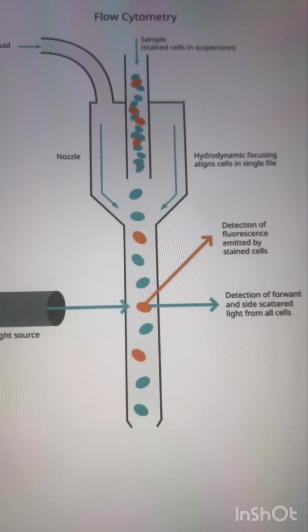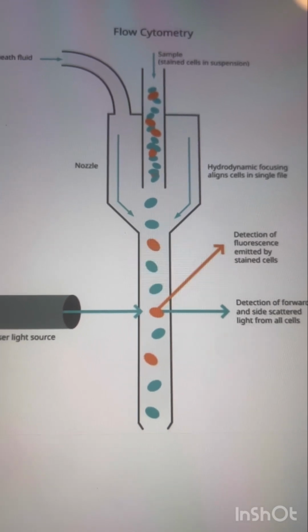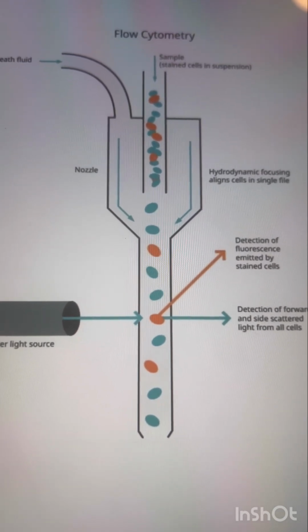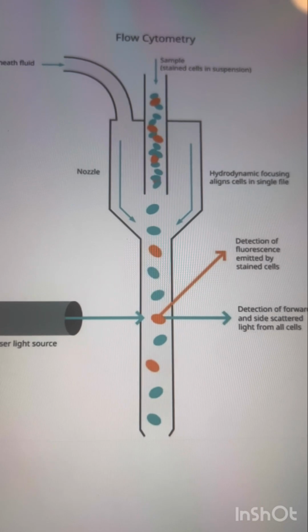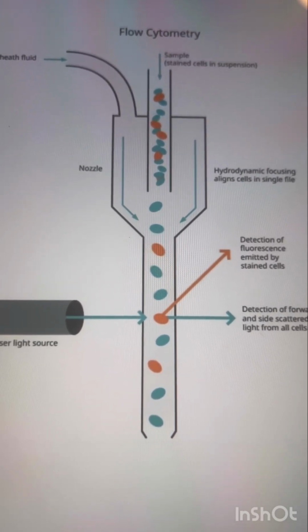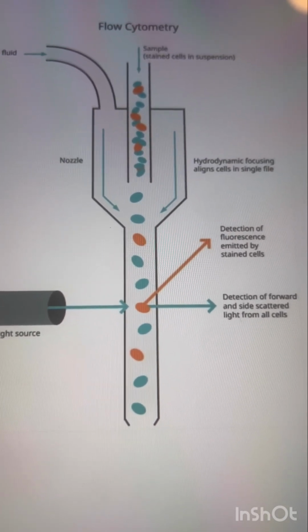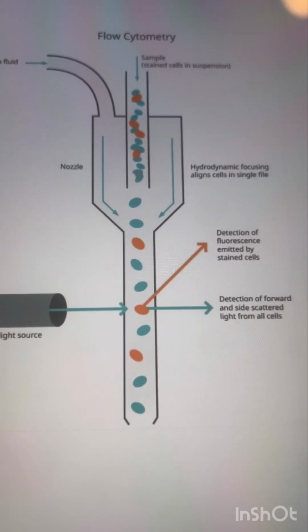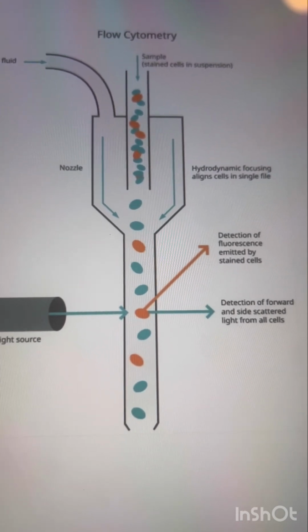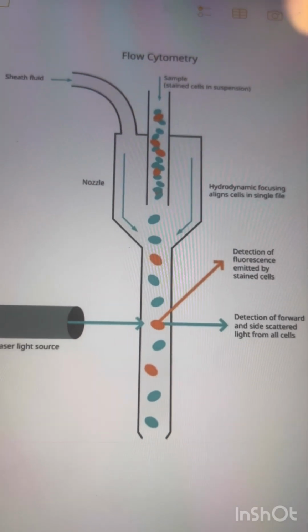If it is blood, bacteria, or small plankton, that's okay. But tissues always stay in aggregated form. So when anyone needs to do flow cytometry on tissues, the tissue should be disaggregated, and when they disaggregate, the tissue architecture related information can be lost.